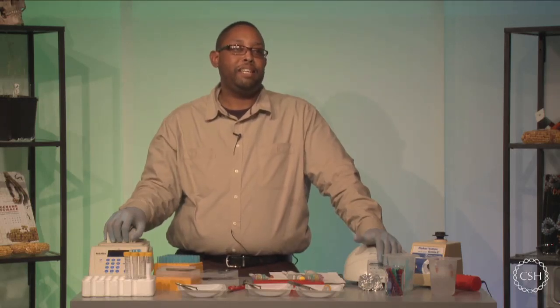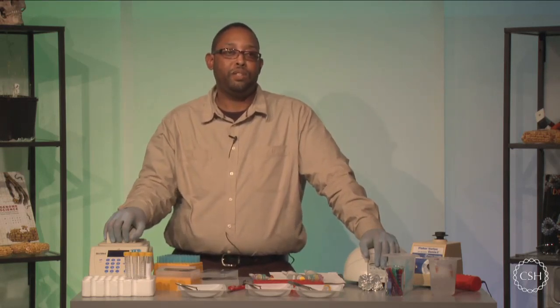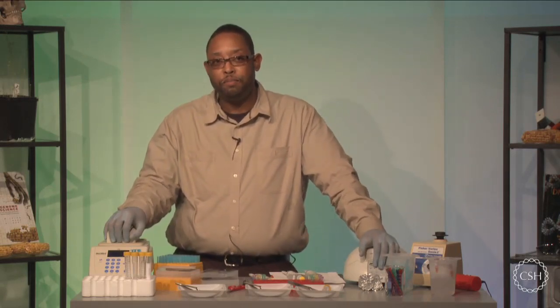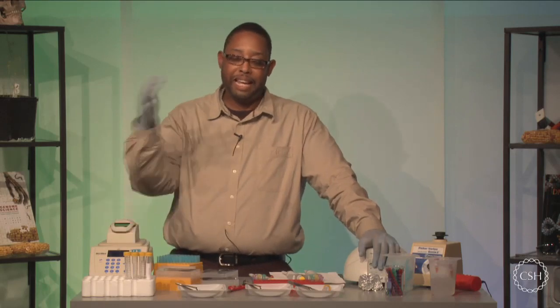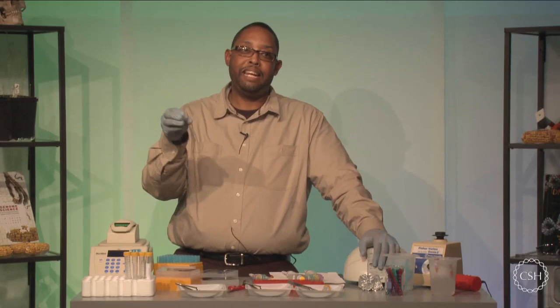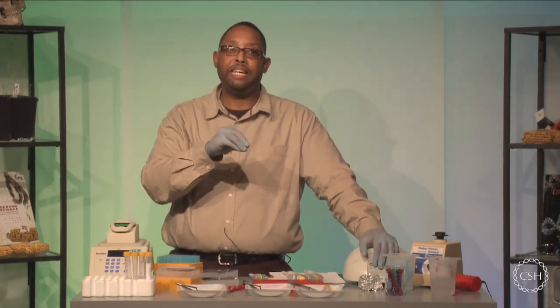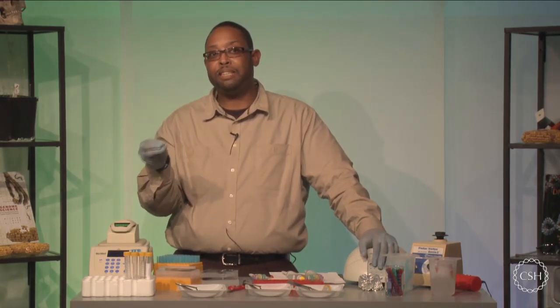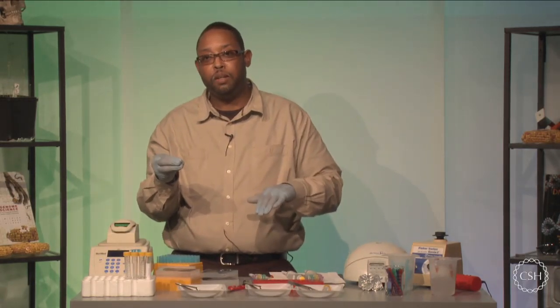So the question we have is, why did the silica separate from the DNA in distilled water with centrifugation so easily? So the silica resin actually isn't soluble in water. So the only thing that is soluble is the DNA. And the idea is that in the lysis solution, it actually cross-bridges the DNA to the silica resin. And in the presence of water, we lose that cross bridge and the DNA releases. Since DNA is very soluble in water, it dissolves, but the silica resin is not. So we can actually sediment the silica resin back down to the test tube.